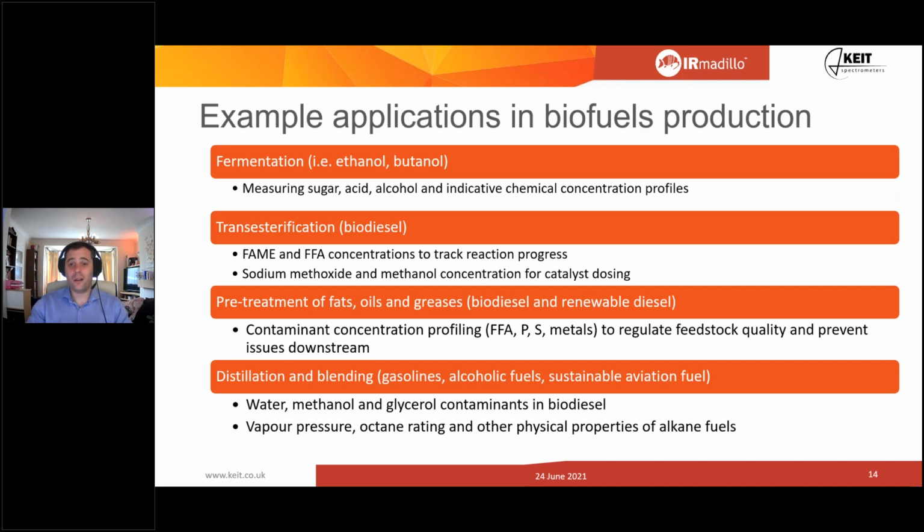So again, artificial intelligence algorithms, we don't need to know exactly what chemical makeup causes the different properties. We can measure the properties, measure the spectra, let the algorithm do the rest, let it do the heavy lifting. Because we're measuring the fundamentals and the fundamental chemistries, we can let the algorithm do the work. You can probably do it with NIR, but you will always get a better result with FTIR. You'll get more precise and more accurate.